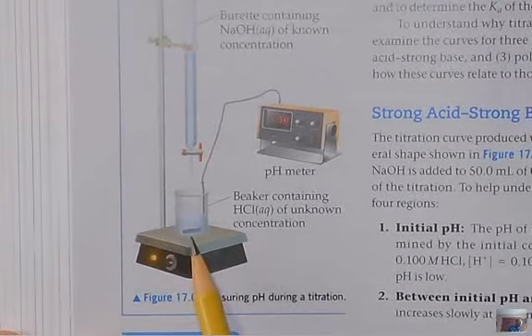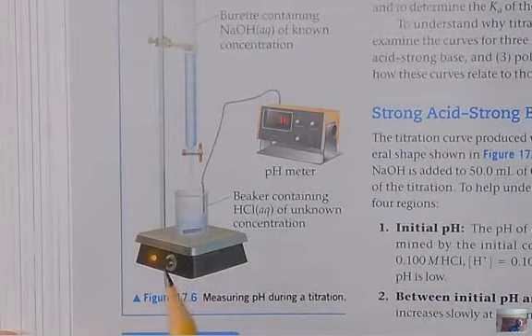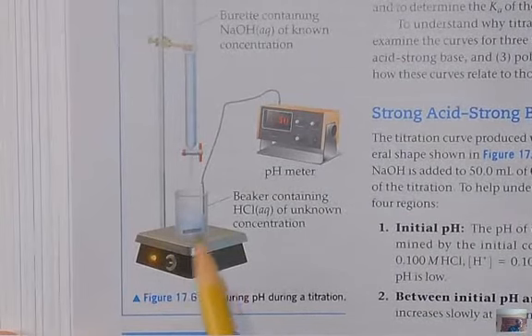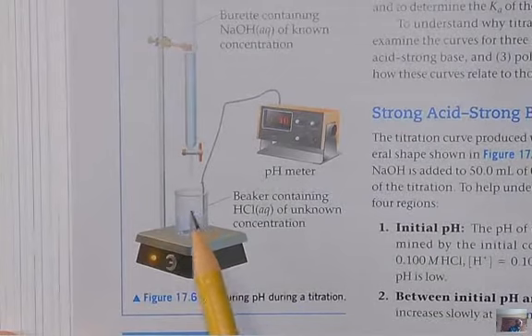We put a stir bar on the bottom. This is a magnetic stirrer. We're not going to heat it up, we're just going to keep it mixing. Once I turn this knob, it's going to create a magnetic field that alternates, and the magnetic stir bar is going to zip around in a circle, and you've seen that before. So you want to keep the solution constantly moving.